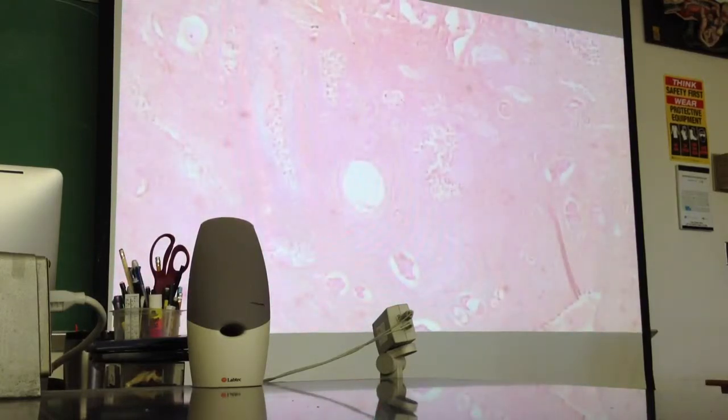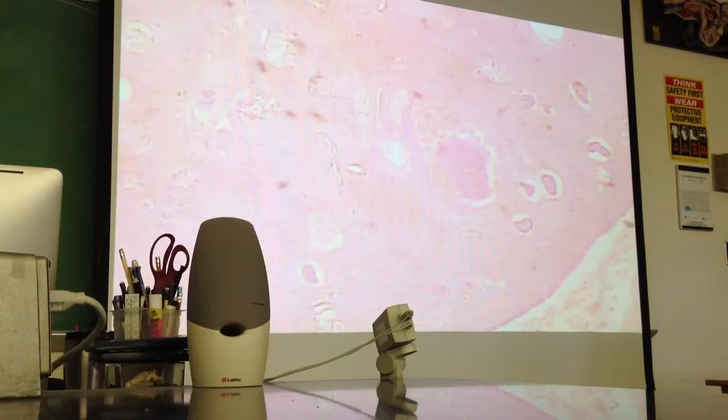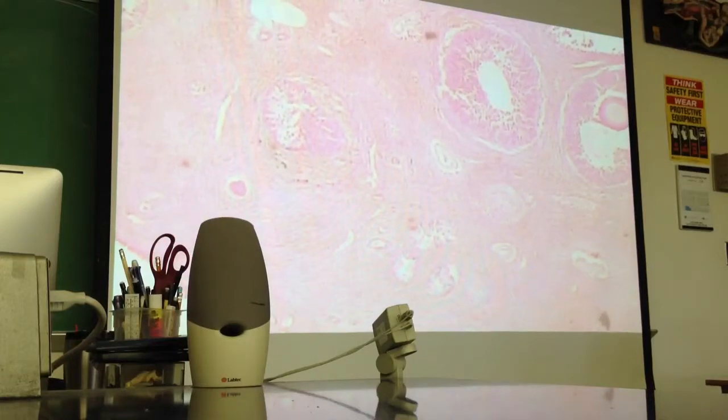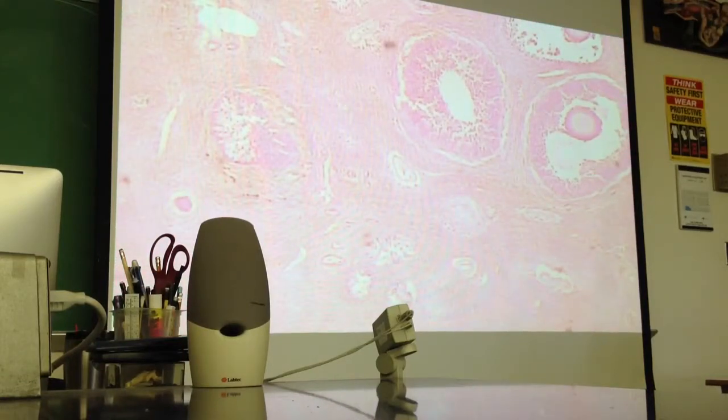With the ovary, it looks like a really awkward Van Gogh drawing to me. If you go around the edges like this, that's where you're most likely going to find our mature or Graafian follicle, and it's just in view on the right-hand side.